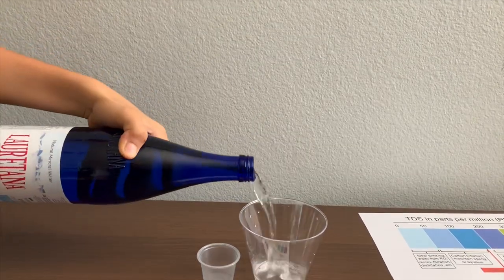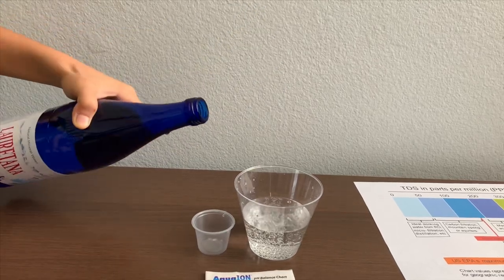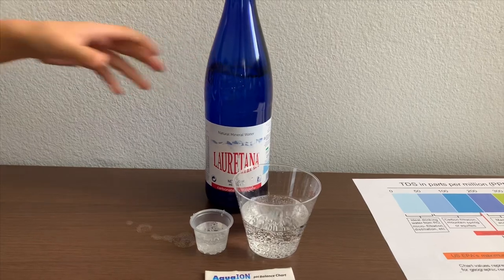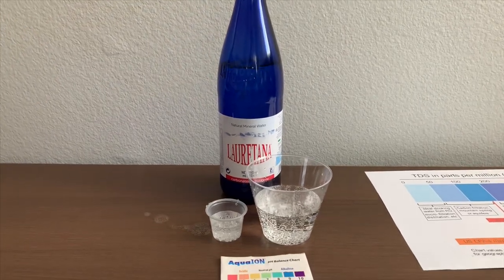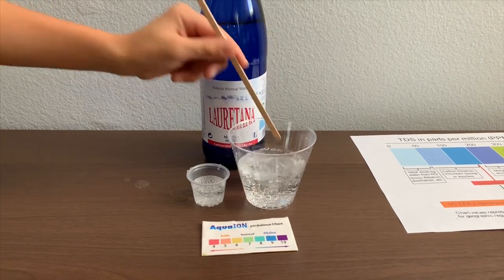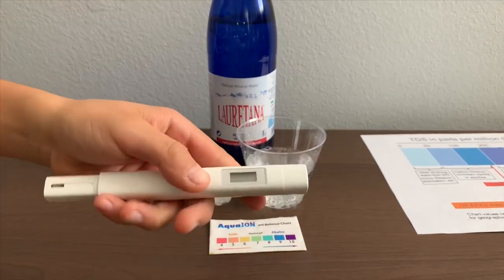Let's pour some water in. First, let's test the TDS level — stir it a little for a better result. If you want to buy this TDS tester, check the link down below.